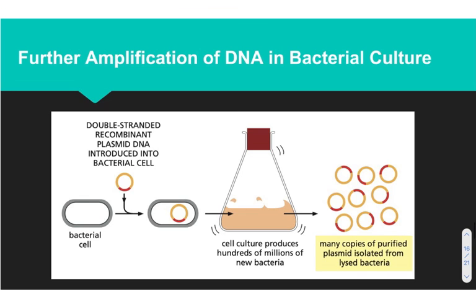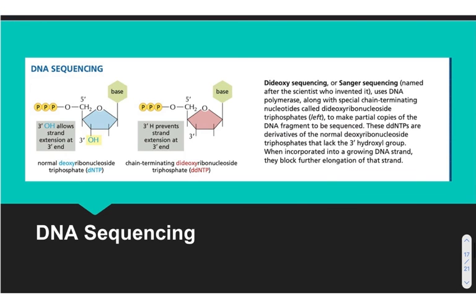Okay, I've got to go fast because my time is going to run out on this app, but we only have a couple methods left to go through. This one is called Sanger sequencing. It's a type of DNA sequencing, and basically the way it works is that we're going to have multiple test tubes with different dideoxynucleotides. So what the heck is a dideoxynucleotide?